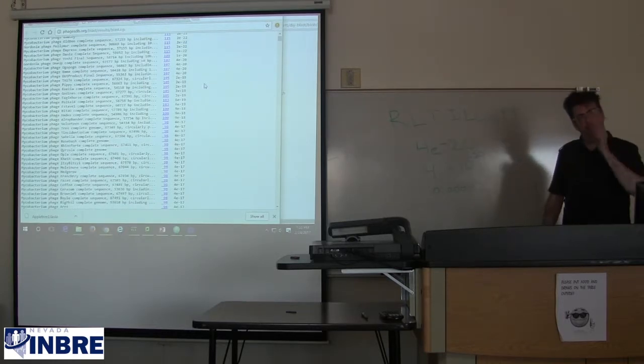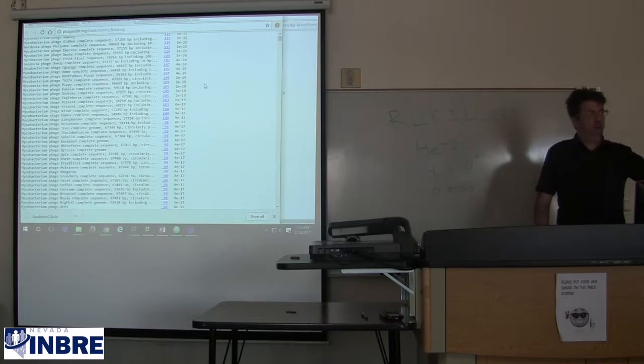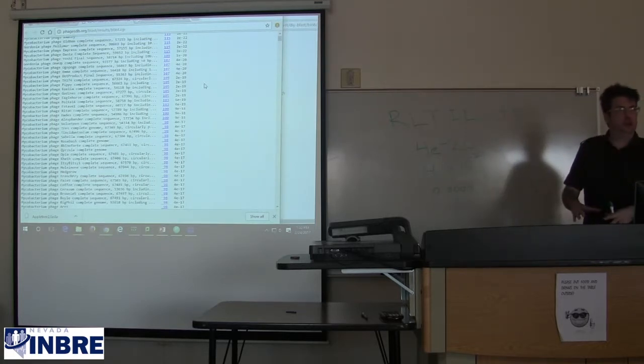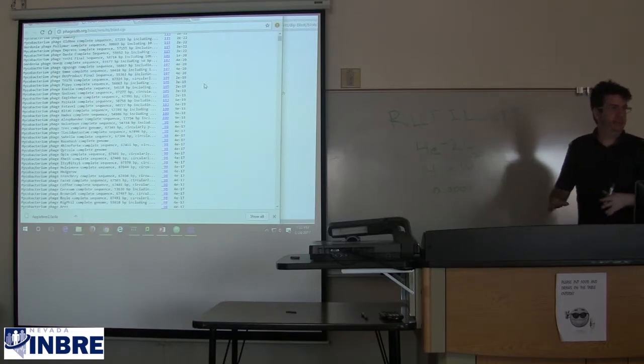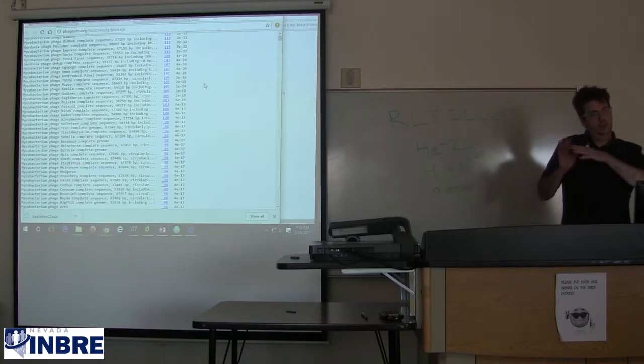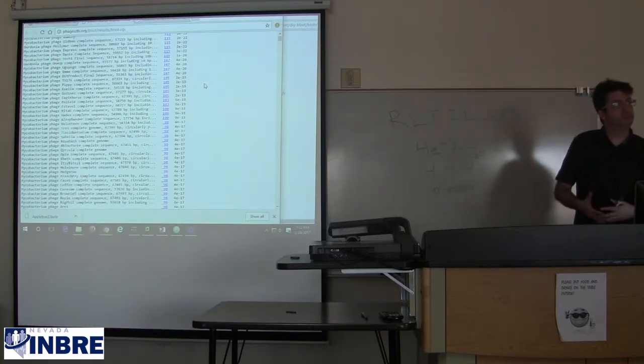If you're trying to find the closest relative or all of the relatives, maybe one of the five at 4 times 10 to the negative 20th is the most well known. Maybe it's been studied since the 80s, and you'll take those hits because this one has the densest information that you can lift from.